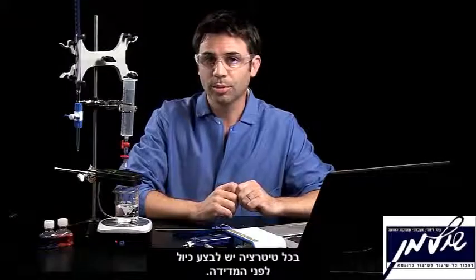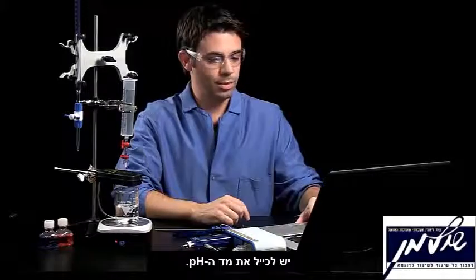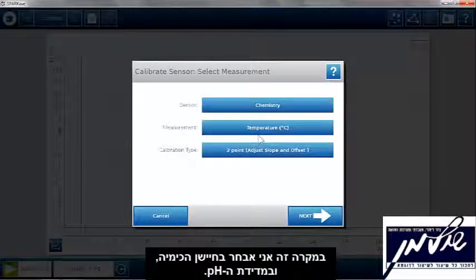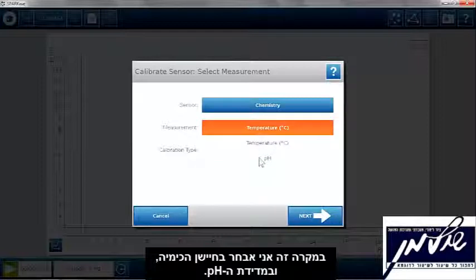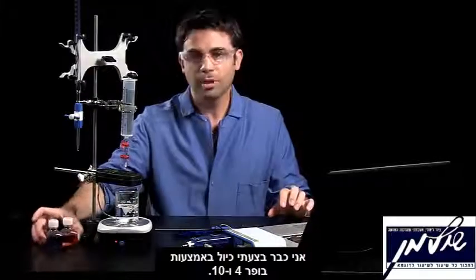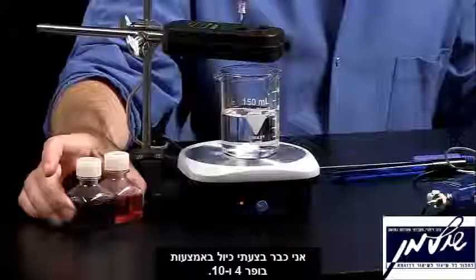With any titration, you want to do some calibrations beforehand. You want to calibrate the pH meter, and to calibrate in Spark, you go to the tools and you can calibrate your sensor. In this case, I can calibrate my chemistry sensor and my pH. I already pre-calibrated this with my buffers 4 and 10.